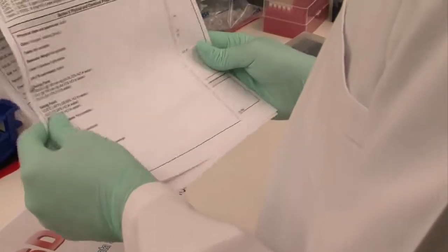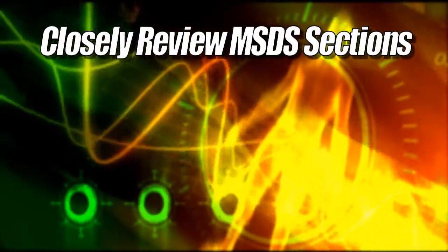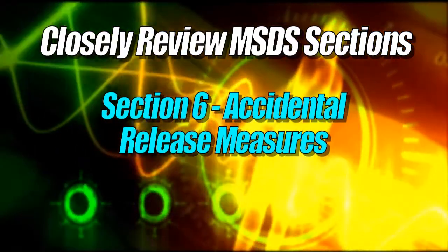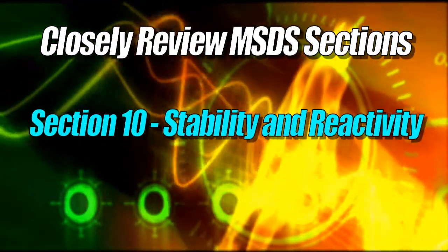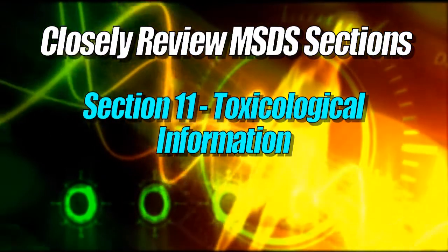When looking at an MSDS, review the following sections very closely. Section 3, Hazards Identification. Section 4, First Aid Measures. Section 6, Accidental Release Measures. Section 8, Exposure Controls Personal Protection. Section 10, Stability and Reactivity, and Section 11, Toxicological Information.